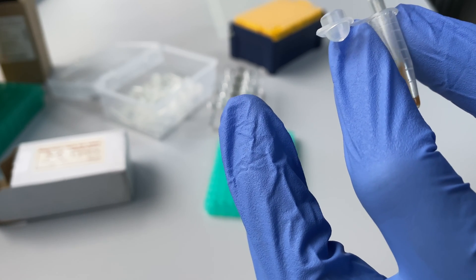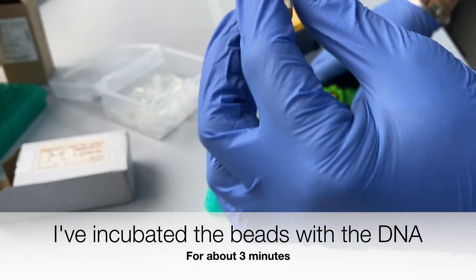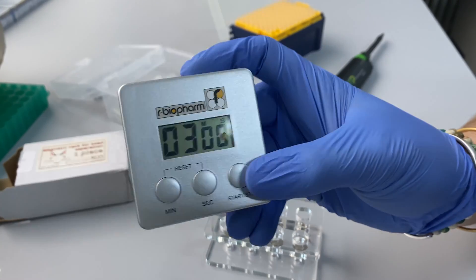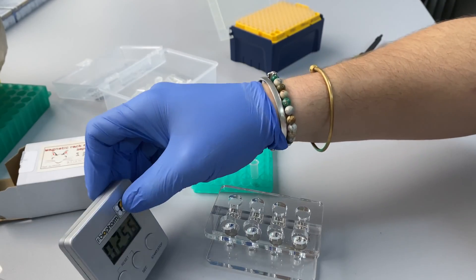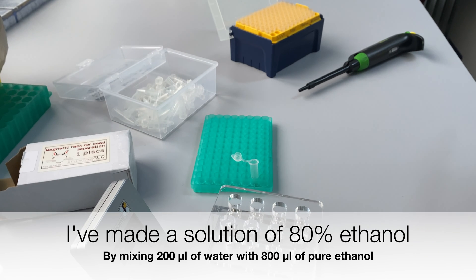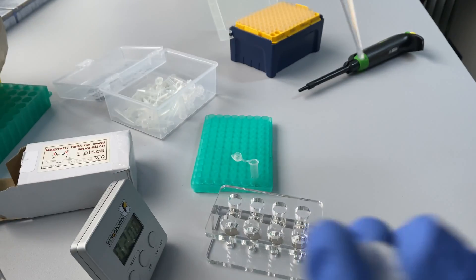I then mixed the beads with the DNA by pipetting and incubated for 3 minutes. This step allows the DNA to bind to the beads. While the beads were incubating, I prepared an 80% ethanol wash solution by mixing 200 microliters of water with 800 microliters of pure ethanol. This is the solution I'll need for washing the beads.